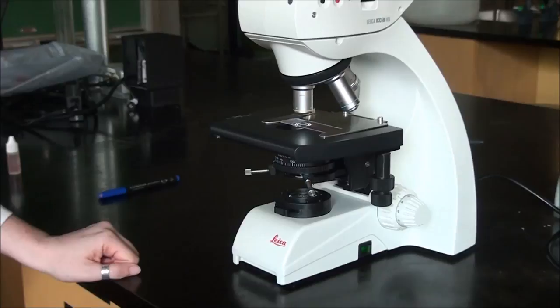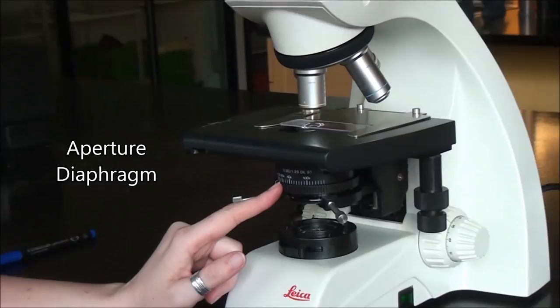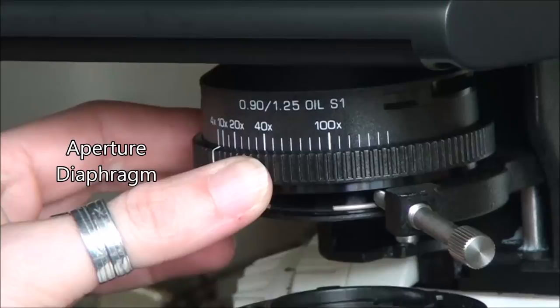One final adjustment we need to make is our aperture diaphragm. Situated on the condenser housing that has our condenser lens, we have the diaphragm that controls the amount of light, and we always want to make sure that it is matching the objective lens.